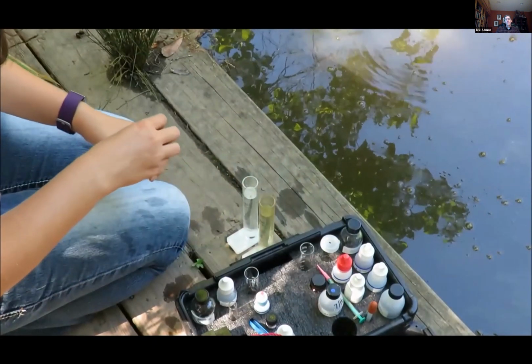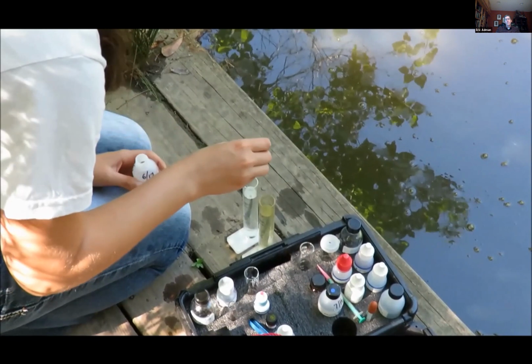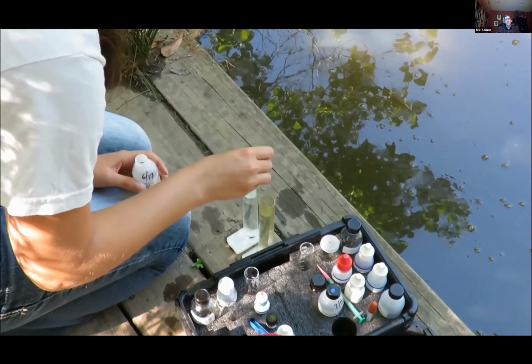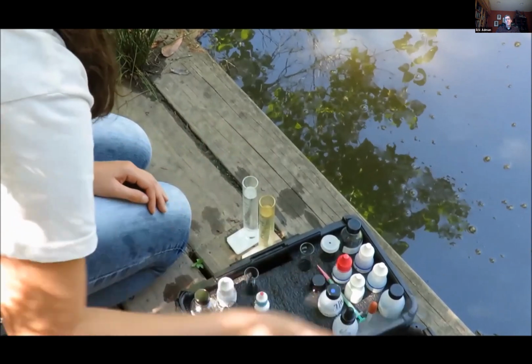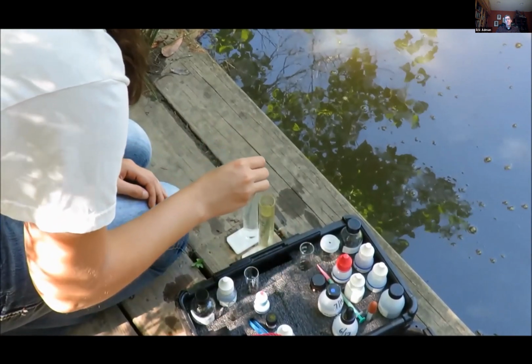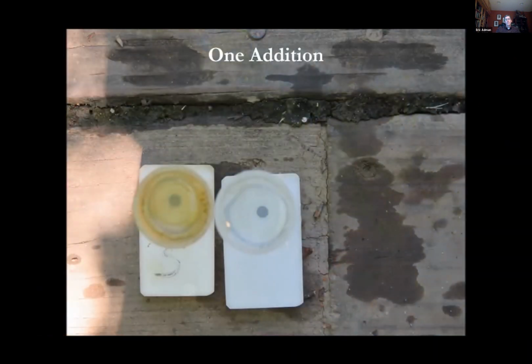Locate the standard turbidity reagent. Shake the bottle vigorously, then add half a milliliter of the reagent to the control column. Mix the contents of both columns with a stirring rod, tapping the rod to remove excess water between stirrings. Place the two columns side by side on a firm level surface and look down through them to compare the clarity or fuzziness of the black dots. Remember not to consider watercolor.